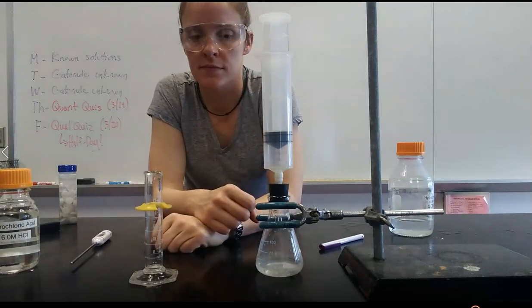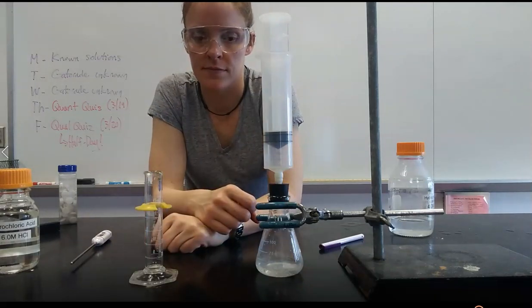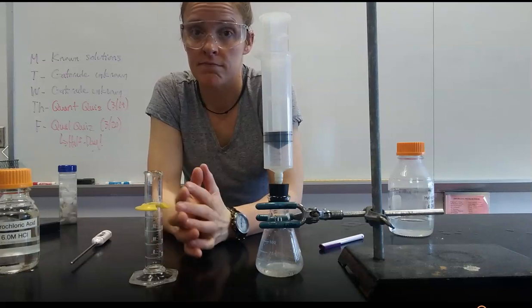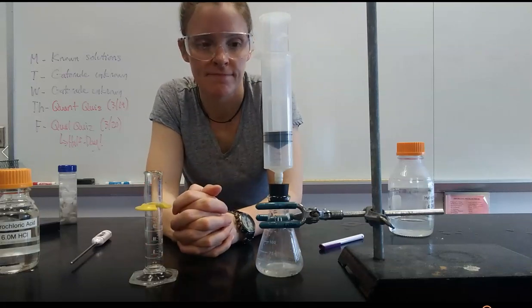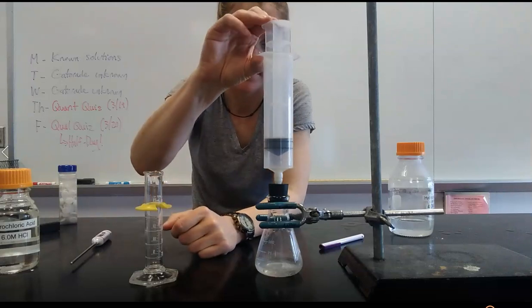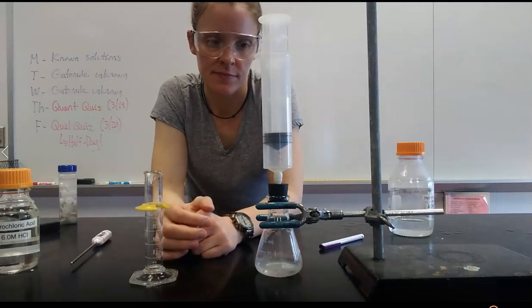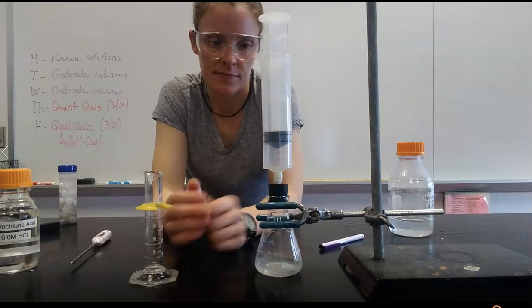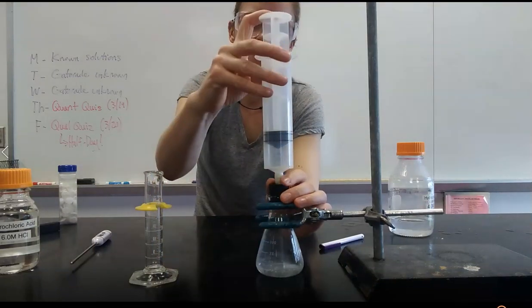We're going to do three different concentrations: the four molar, three molar, and two molar. We're also going to do a temperature study. So think about how you could change the temperature of the system. And then we're going to do one independent study where you and your lab partner will investigate a factor that affects the rate of a reaction.